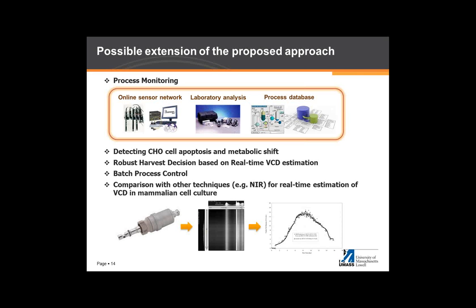And also, right now in bioreactor operation, very little control concept is introduced, except for the dissolved oxygen, pH, temperature, and the flow rate of sparging. But there isn't any control methodology with which you can really control the viable cell density or specific titer and so on. But there are a lot of research groups working on this batch control methodology. And this real-time viable cell density measurement is going to contribute significantly to batch control methodology for the bioreactor.